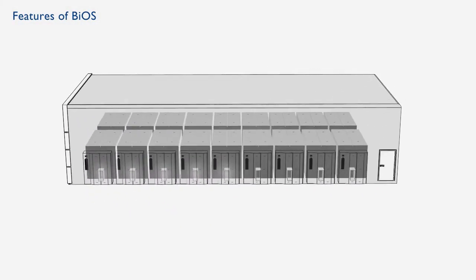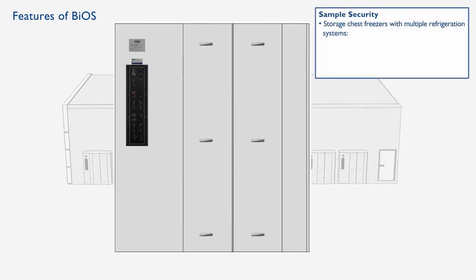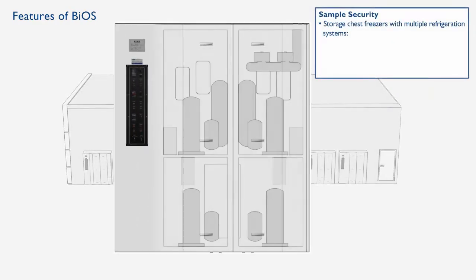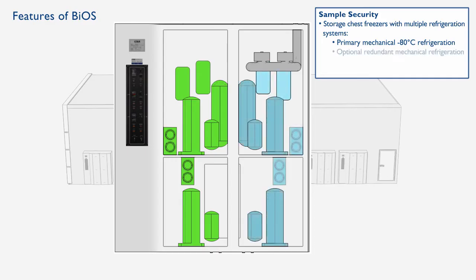Samples are stored in ultra-low temperature chest freezers, featuring multiple redundant refrigeration systems. The refrigeration equipment is located externally for easy service access.